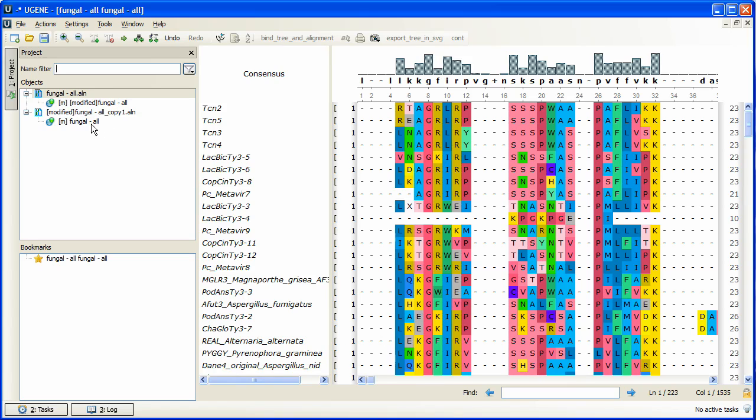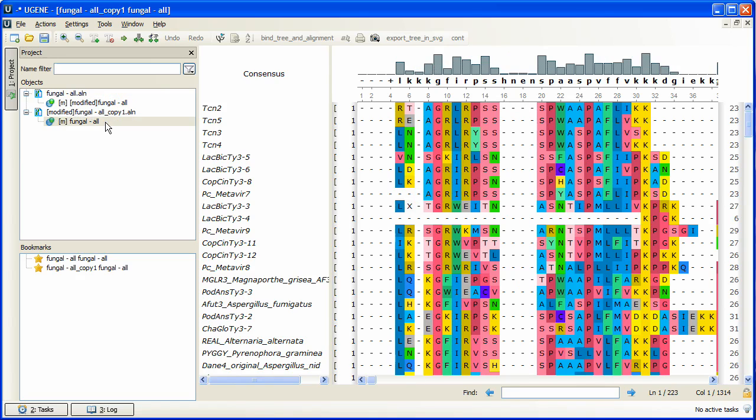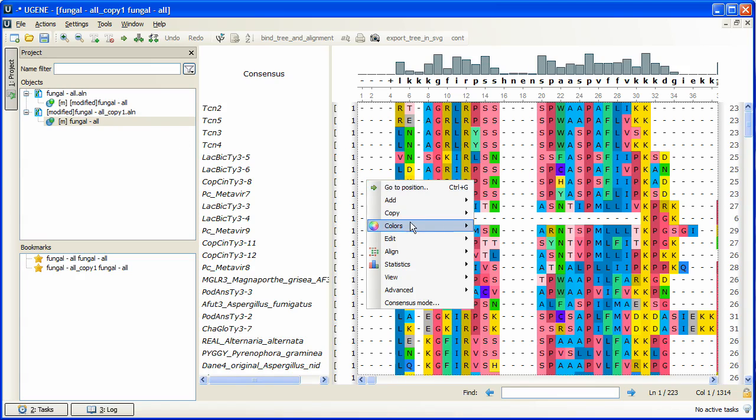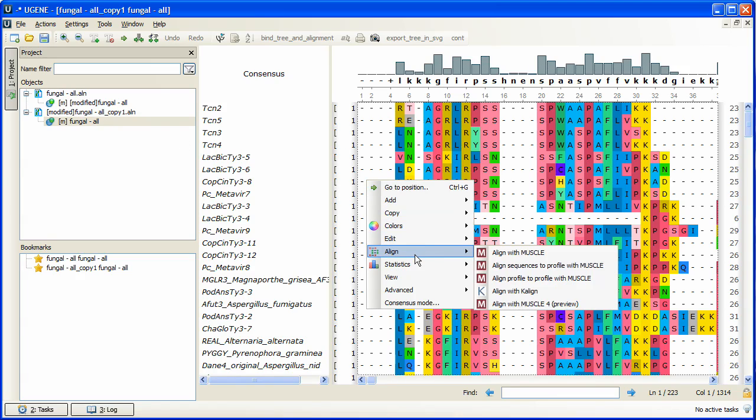We activate the alignment by double-click on its item within the current project view. Now we activate the Alignment Editor context menu and select Align – Align with K-Align.